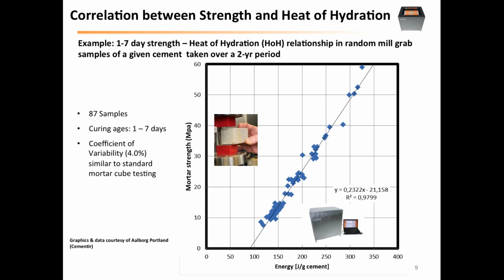Of course, if you push it and you start playing with extreme values of alkali contents and other things that are a little esoteric, you might get out of range of this correlation. But outside of cases that you can quote in books, or that you can engineer to disprove that there's a good correlation, I think in general you will find that for the cement that's manufactured today in a normal cement plant, you will find a good correlation, excellent correlation between heat of hydration and compressive strength.